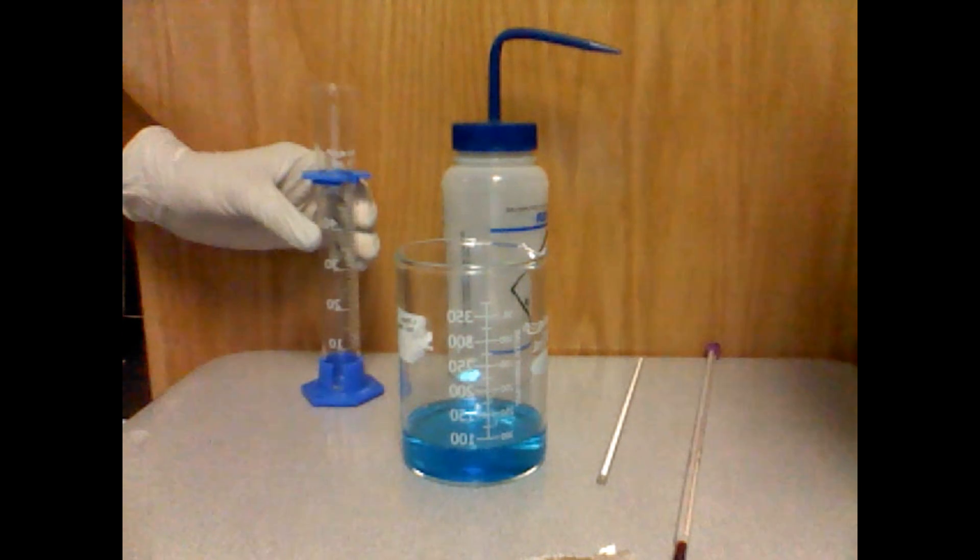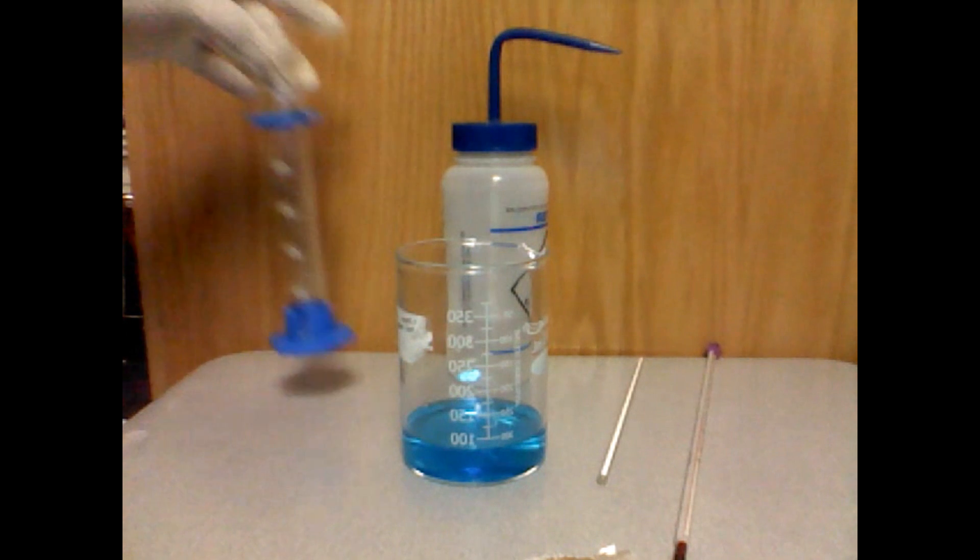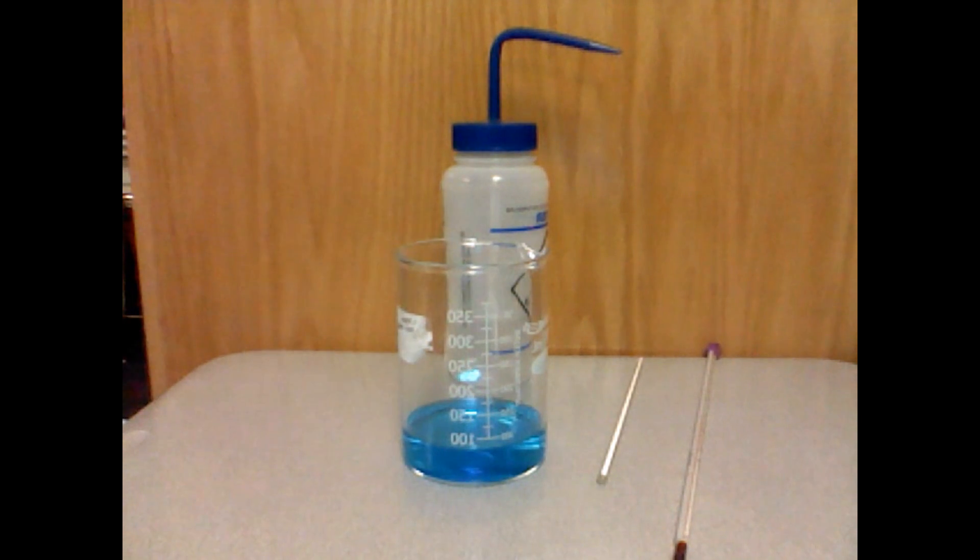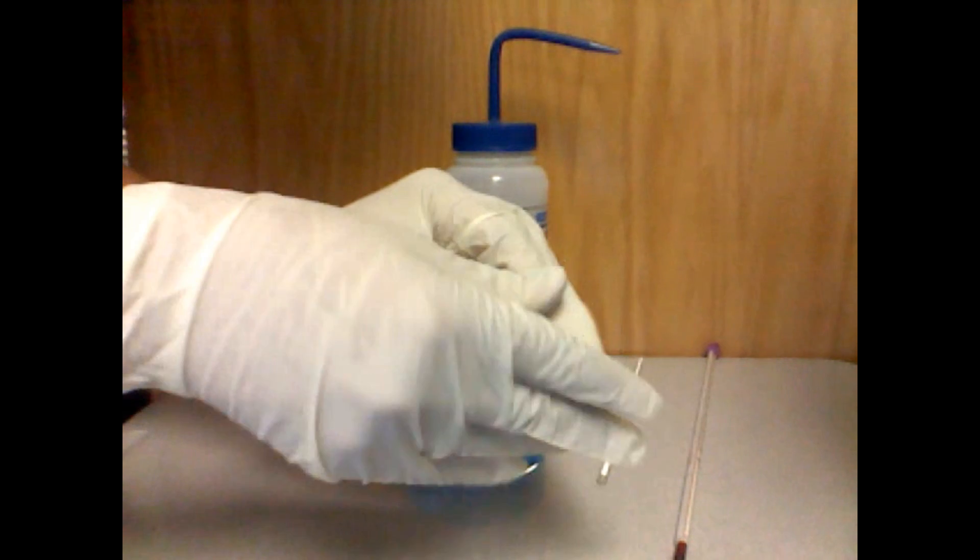We have our piece of aluminum, and now we will loosely roll the foil enough to make it fit into the beaker.